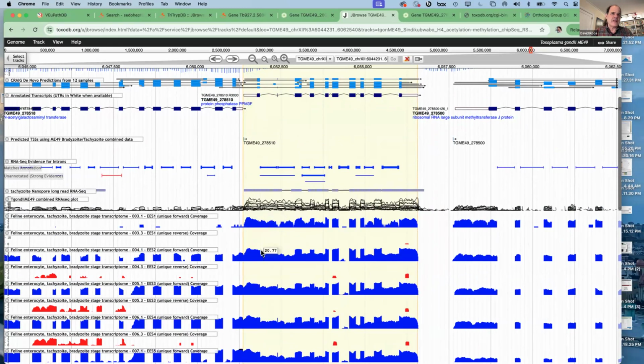So my guess is that roughly 15% of the time this intron is not excised, that probably has no functional consequences and probably should not be annotated as a non-functional RNA, but that's a judgment call. And if you are working on this gene, you should be aware of that in case there is additional evidence that suggests this may be important. Same thing applies for the second intron.